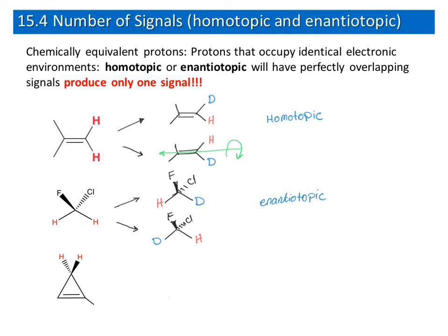Now let's look at the last structure. Again, we can do the replacement test.